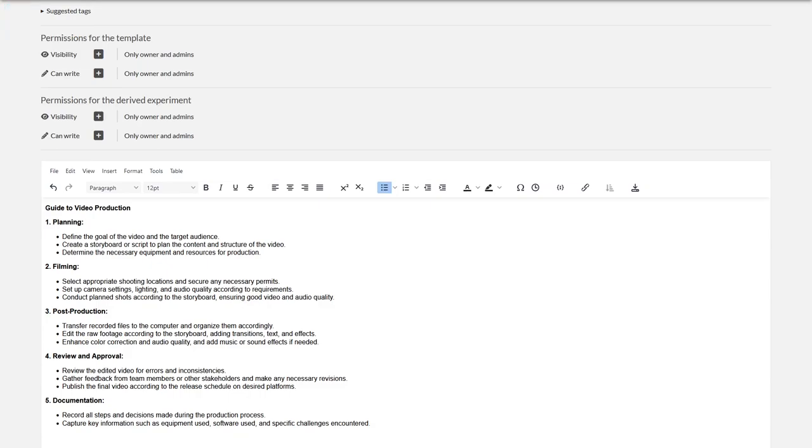For laboratories on the other hand, work instructions could be provided here. Consider what makes sense for your templates.